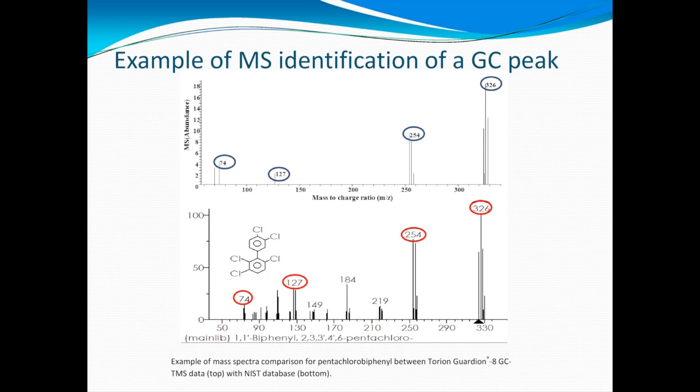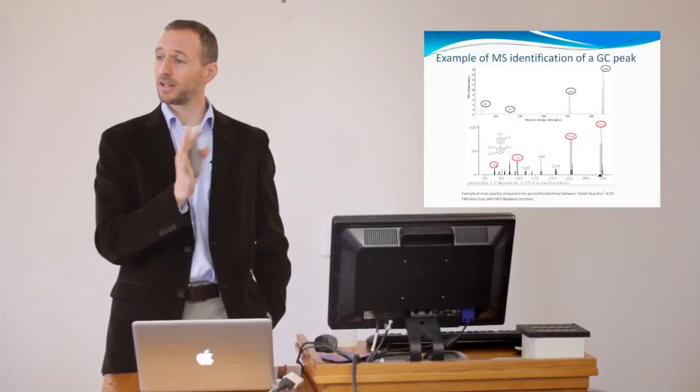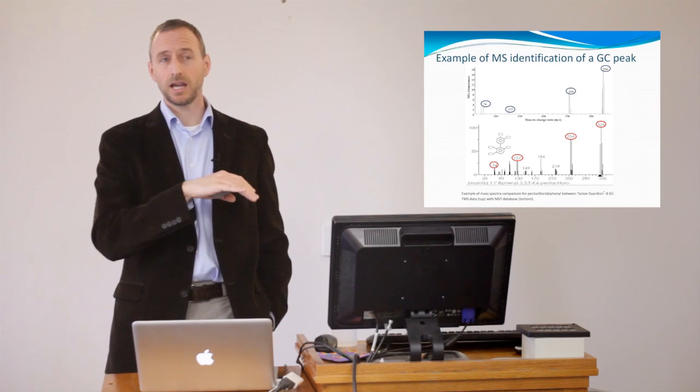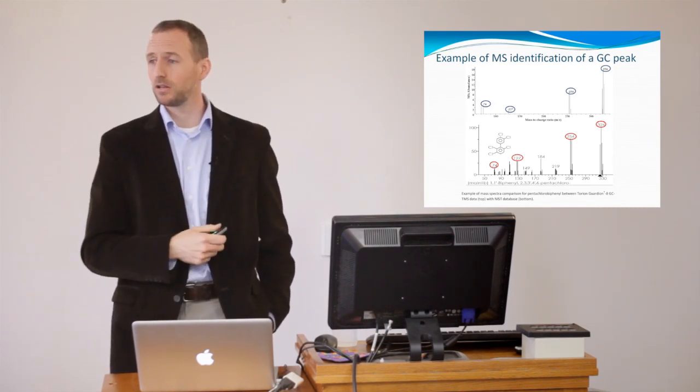On this particular portable instrument, what we have is a mass spectrometer, and we can go in at any given time and look at the fragment ions that are coming out, and there may be a molecular ion and some fragments, and we can compare these to a database and see what we may have. So we can actually use this instrument to identify the compounds we're interested in. If there were peaks that showed up at odd times that we didn't know what they were, we could use this to help identify unknowns as well.